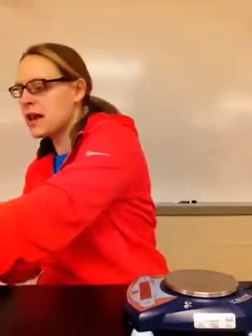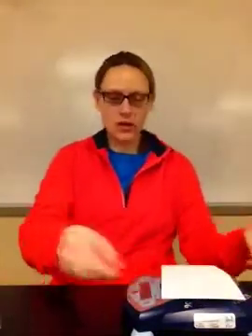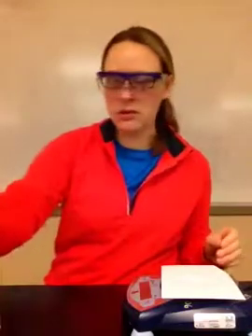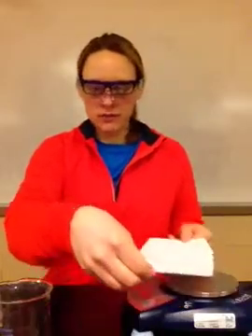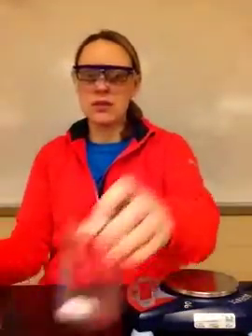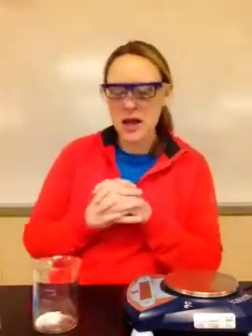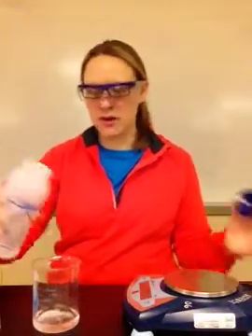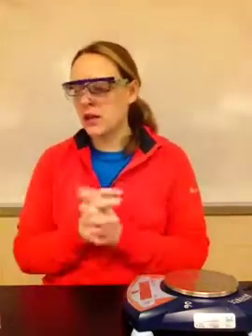Okay, you do the exact same thing with the other white solid. Oh, I also forgot. You need to wear goggles at all times. These don't really work with my glasses, but it's okay. So you are going to mass out your other reactant. Notice I put it in a separate beaker. Key. Okay? Make a note of that. You want 2 separate containers to put these reactants in. Okay? I'm going to add enough distilled water. I'm out of distilled water, so I would have to go get more. You want to keep stirring it until it's all dissolved.